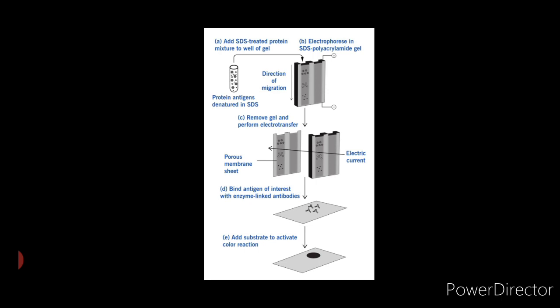These antibodies would react specifically with antigenic epitopes on the target proteins, and this facilitates in establishing the presence or absence of antigen under investigation. Thus, Western blotting combines resolution of SDS polyacrylamide gel electrophoresis with specificity of immunochemical detection. It is therefore very useful in determining the presence of antigen as well as relative molecular weight of polypeptide chain. It is also a powerful technique for ascertaining the presence and specificity of antibodies from polyclonal sera.